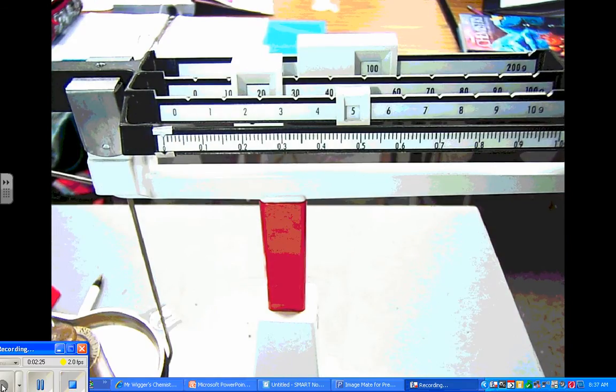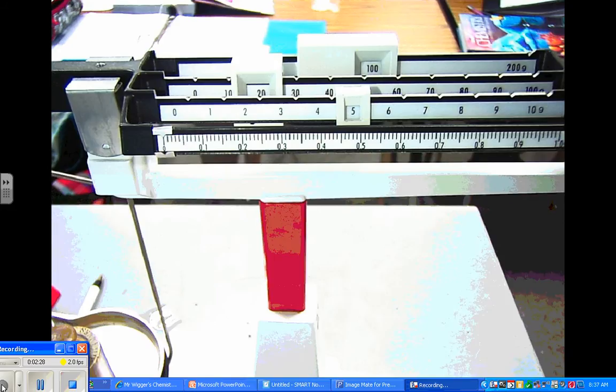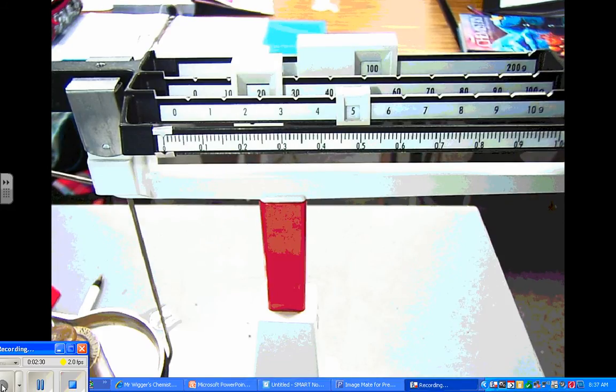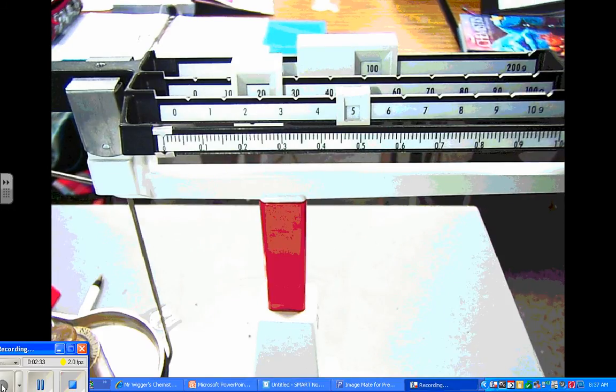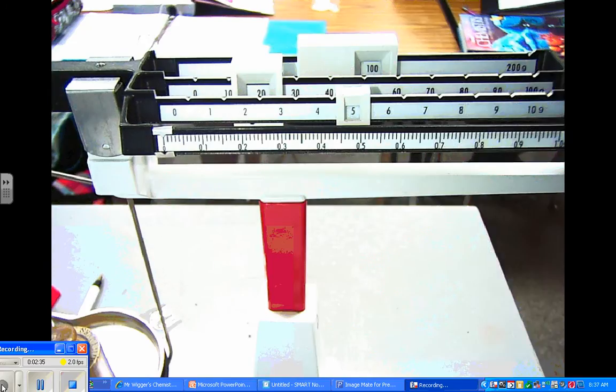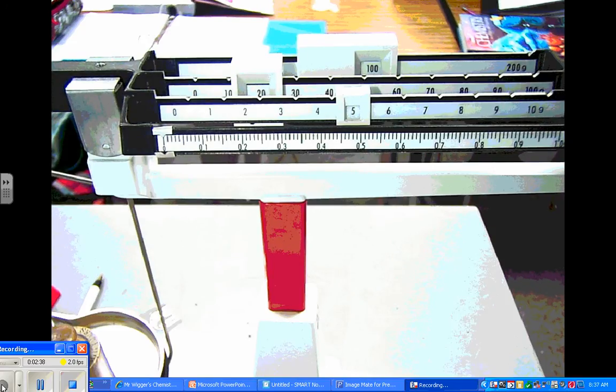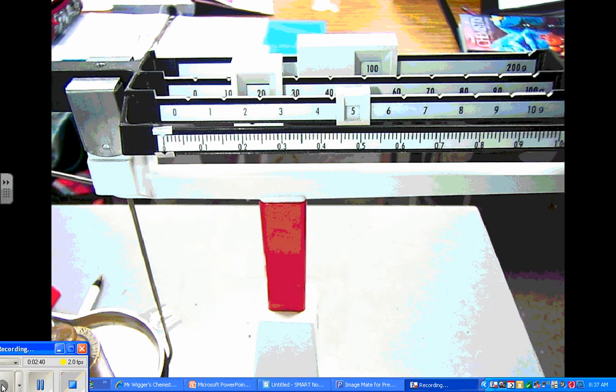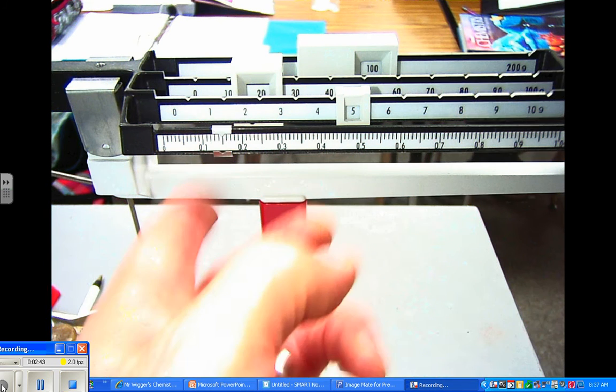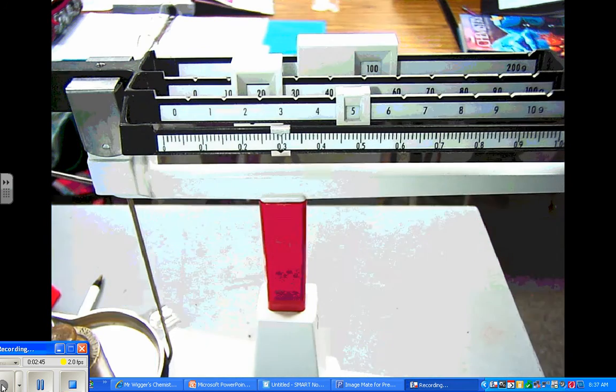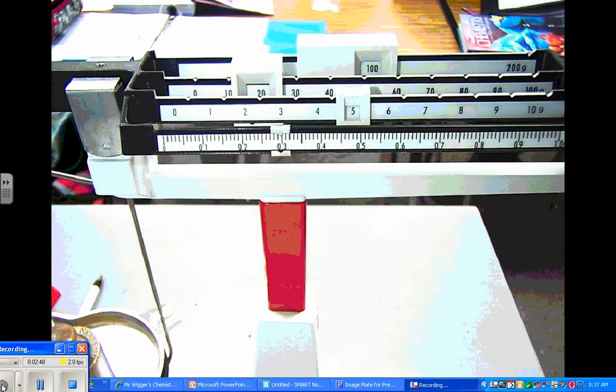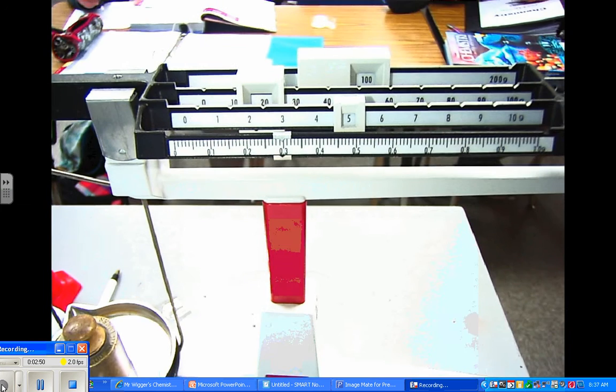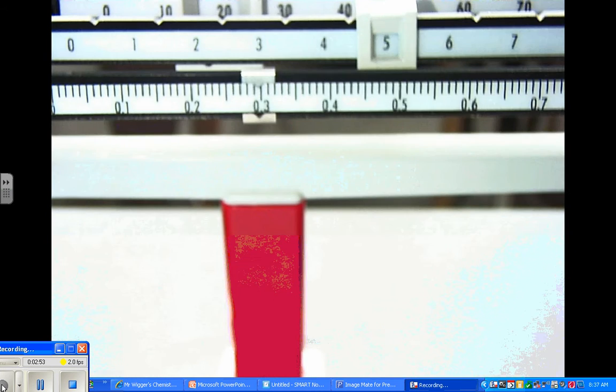Good. Now let's look at this little slider and what that does. That's where you get your accuracy. That guy is going to tell you within one one thousandth of a gram the mass of the object that's on your pan. So let's just move this over here.